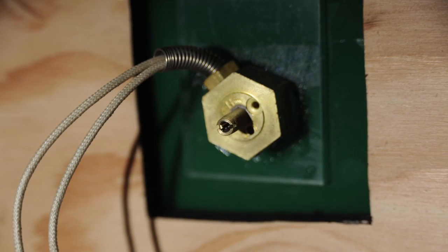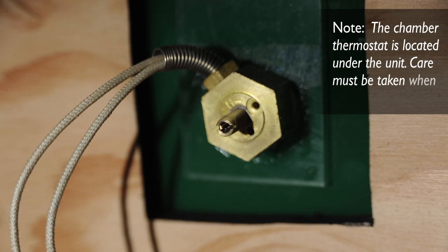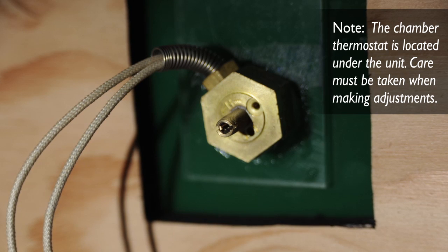The thermostat, located in the testing area of the chamber, controls the temperature inside the chamber at 95 degrees Fahrenheit, plus or minus 2 degrees, or 35 degrees Celsius. The thermostat controls an air heater mounted to the blower. This thermostat has been factory set and should not require adjustment.